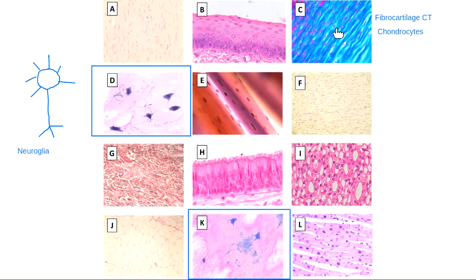Let's see. We also technically have not talked about this type of tissue yet. I know it's not the best picture in the world, but can we tell what type of tissue tissue J is? Yeah, so we are correct. It's not an awesome picture, but this is an example of adipose loose connective tissue. I say that this one is loose because there are no proteins in between my cells. I only have cells that I find in adipose loose connective tissue.